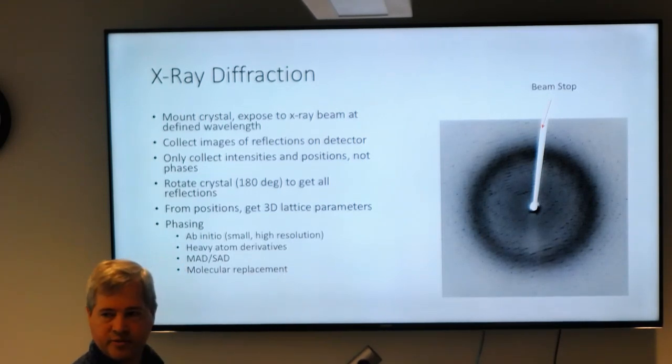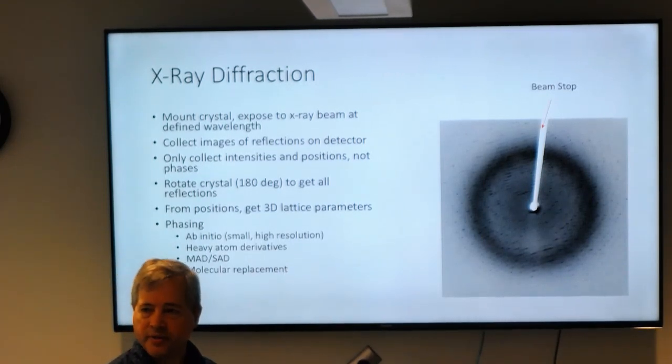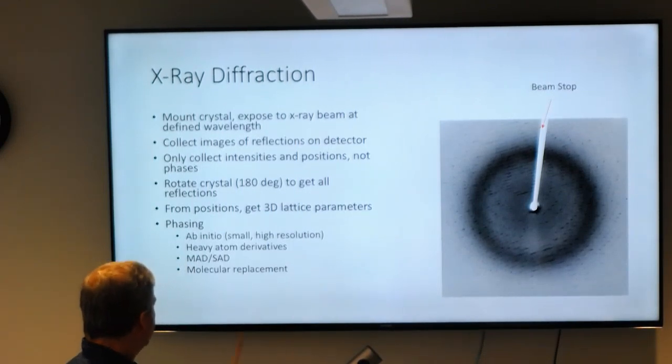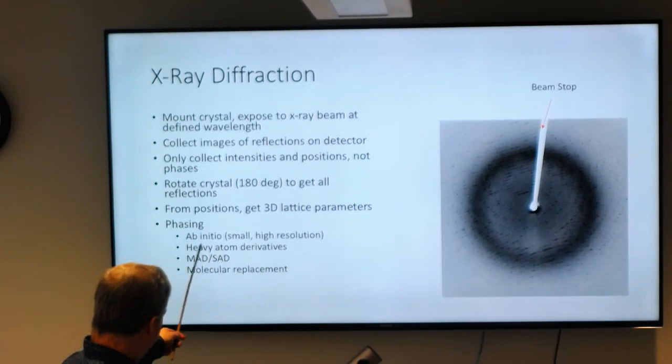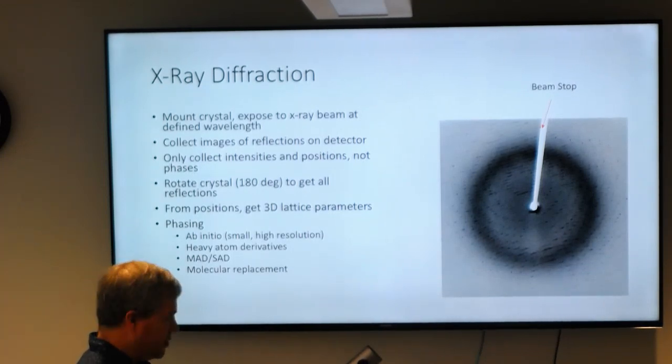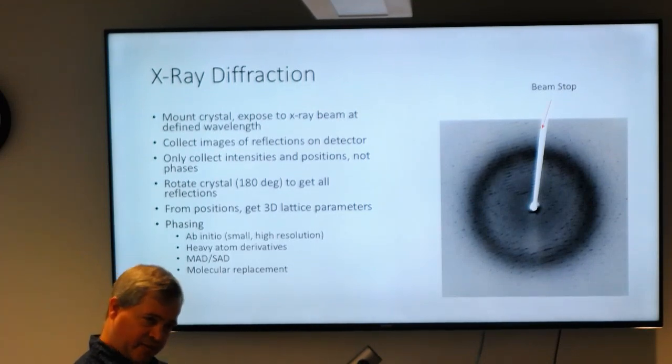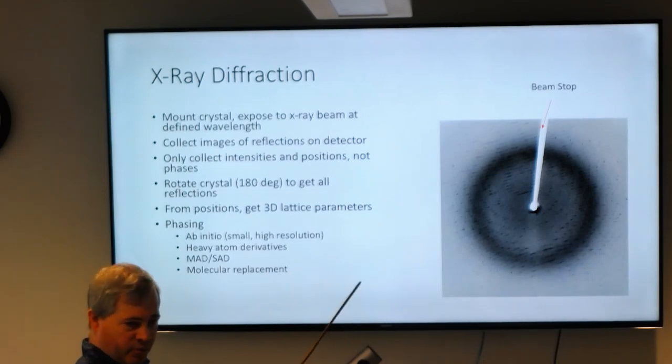You also have to have high order diffraction, better than about 1.5 angstroms or so. Otherwise, the method doesn't work; it probably can't converge. For real protein crystals, another way is to use what are called heavy atom derivatives. You have your crystal, and you soak lead or some sort of heavy metal element into the crystal itself, and then you get the diffraction of that, which is presumably lying along the lattice, and from that you can get the initial phases and then work your way back.